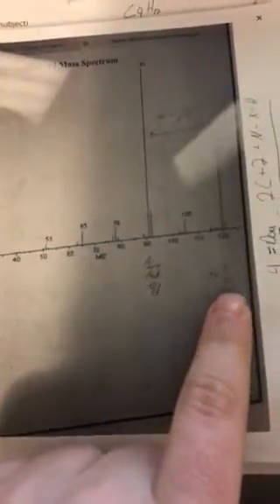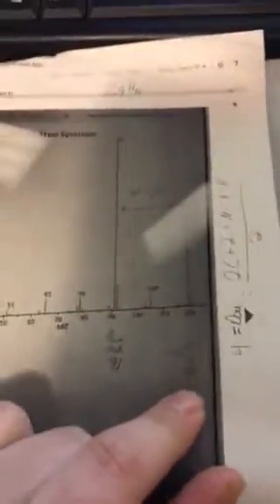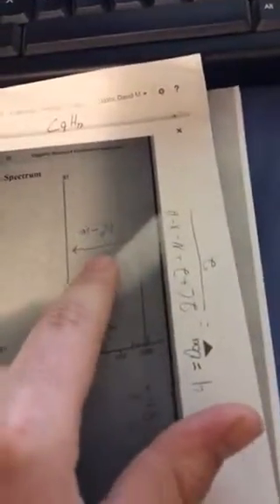First, you look at the mass spec and you note the M+, which is the furthest peak out. In our case, it happens to be at approximately 120. Next, we will look at the base peak, which is at approximately 91, which we can note is M minus 29.